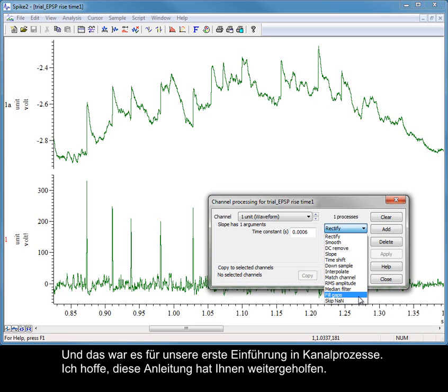And that's it for our first introduction to channel processes. I hope that you've found this tutorial useful.